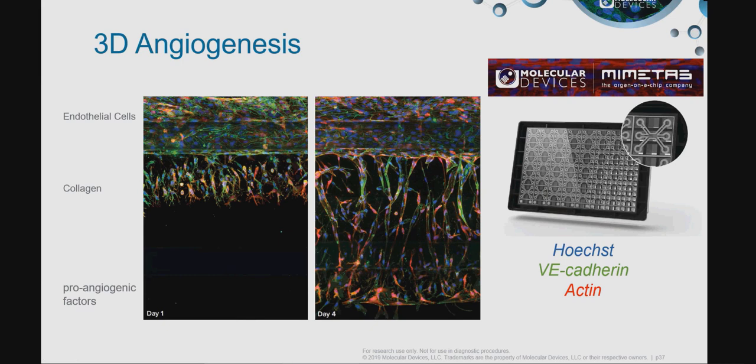environment. And I'll show you a 3D analysis of looking at this, which is what we're able to look at right now. What you're seeing is the projection. So I'll show you a rotation here of the segmentation coming up. Okay, so these angiogenic sprouts are allowed to form for up to 4 days, and then they're fixed and we compare them depending on the different treatments.